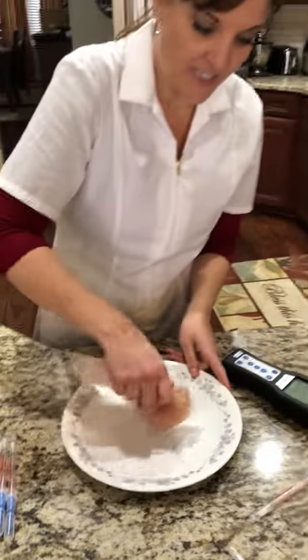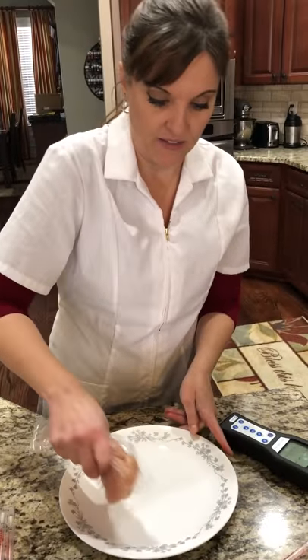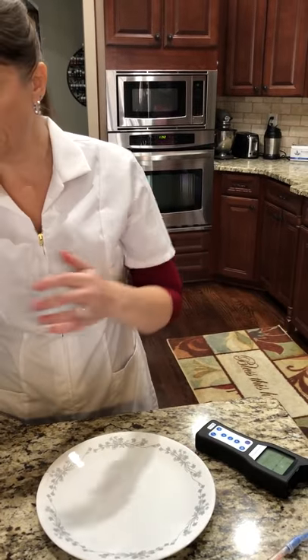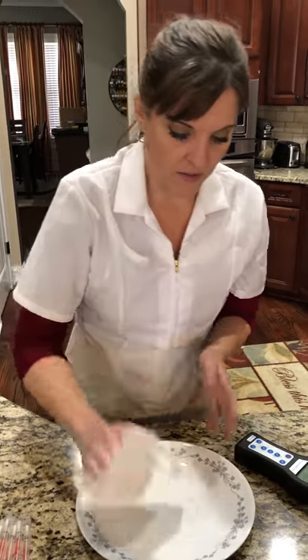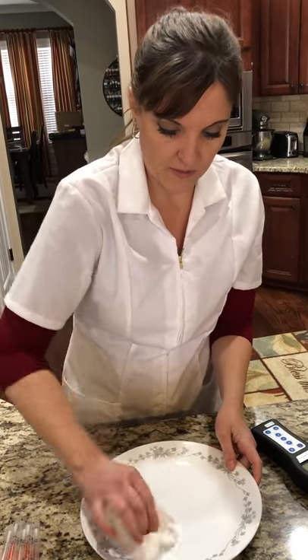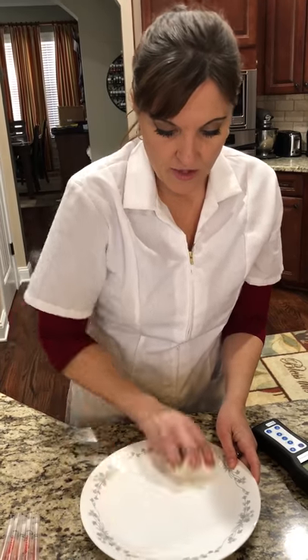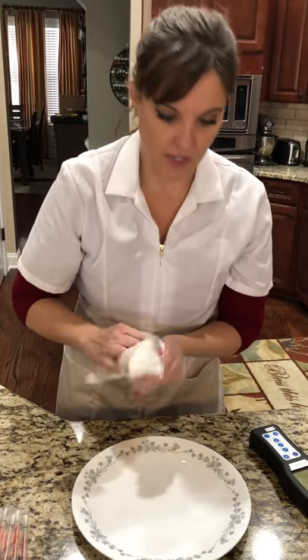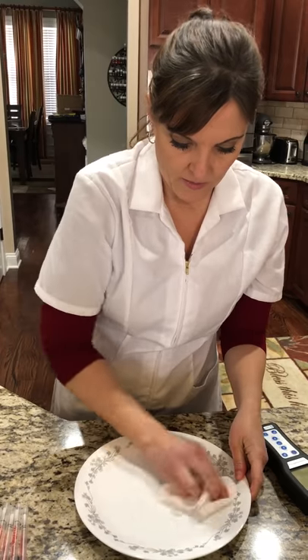Now we're going to do the light degreasing — that was the heavy degreasing for Thieves. We'll see how well the light degreasing works because a lot of people use that since it's mild and you can use it on granite, floors, and everything. And the light degreasing is at a 2% dilution ratio.